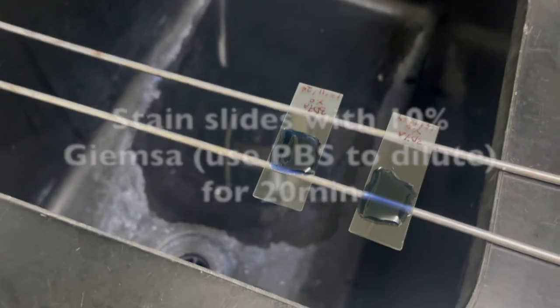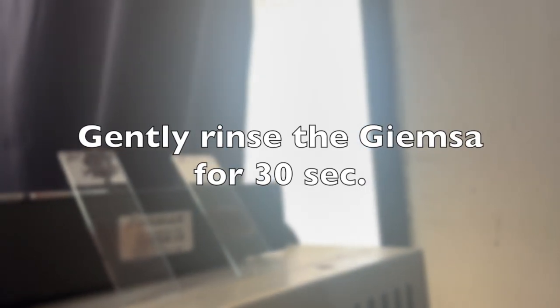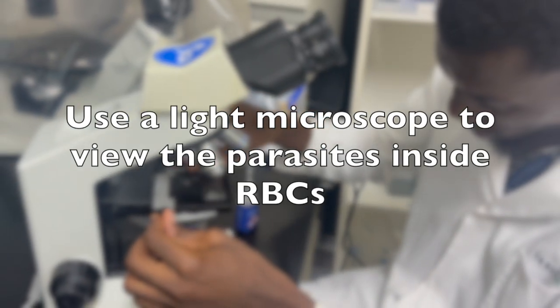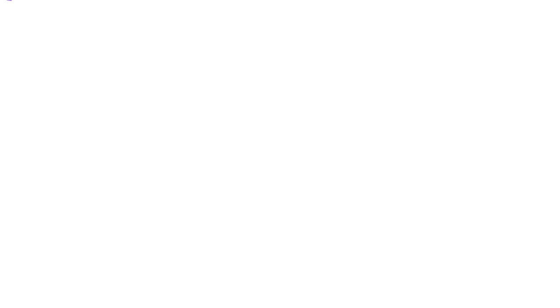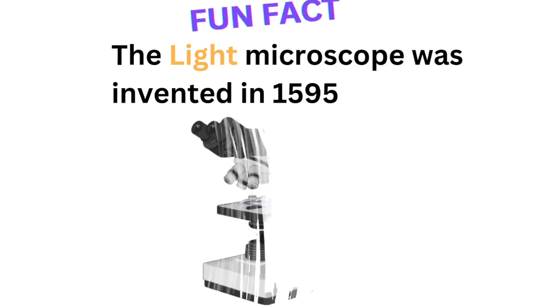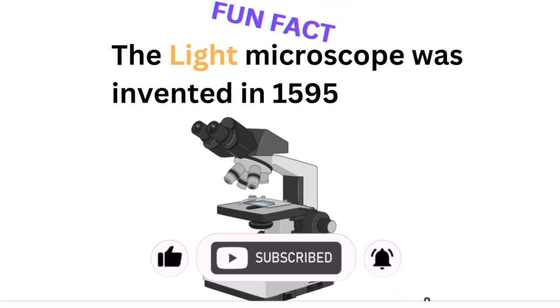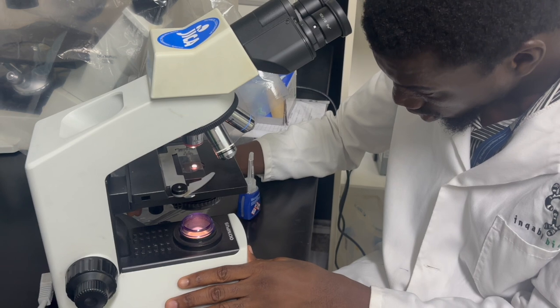Fix the slides for four to five seconds in 100% methanol. Then add your 10% Giemsa diluted in phosphate buffered saline and leave it on for 20 minutes. Gently rinse the Giemsa off the slides and allow them to air dry before viewing under a light microscope — a light source microscope, the first type ever invented.